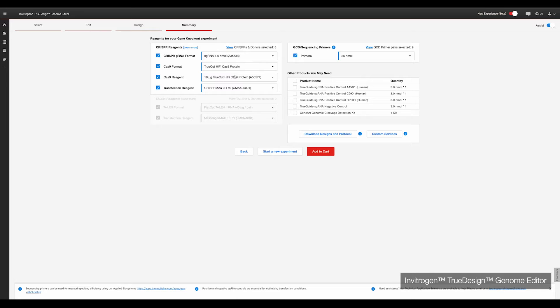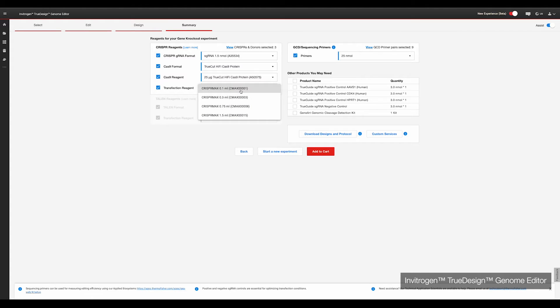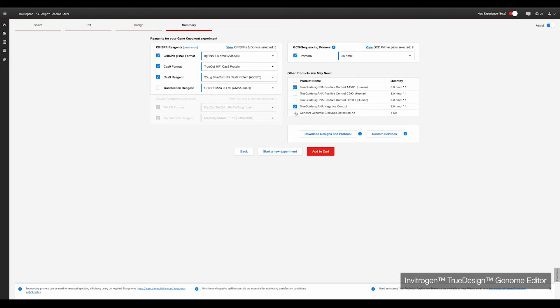For today's experiment, we will need gRNAs, TrueCut HiFi Cas9 protein, GCD primers, positive or negative control gRNAs, and a GCD kit. Click the download designs and protocols button for a summary document of everything needed for your experiment. Then click the add to cart button and all selected reagents will be ready for ordering.